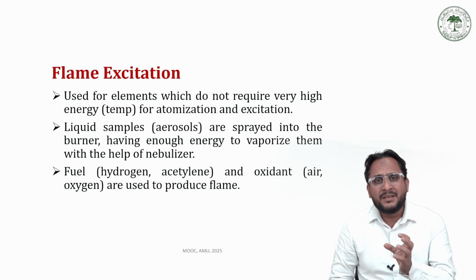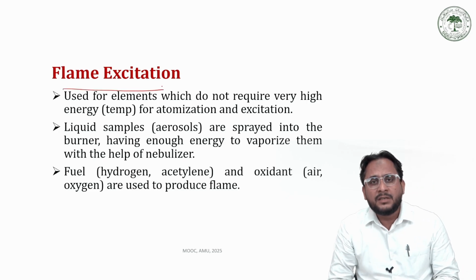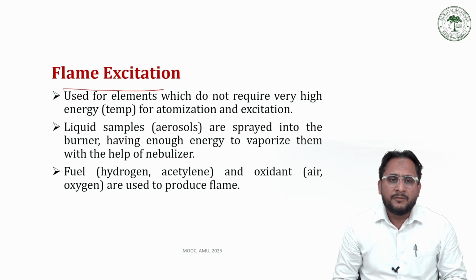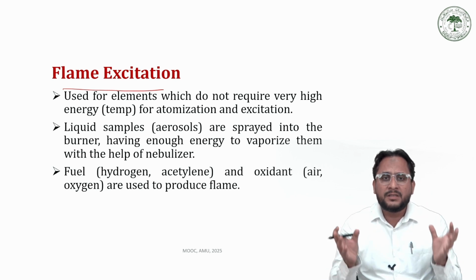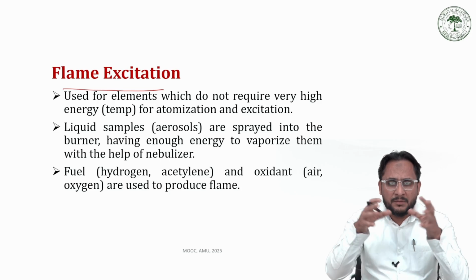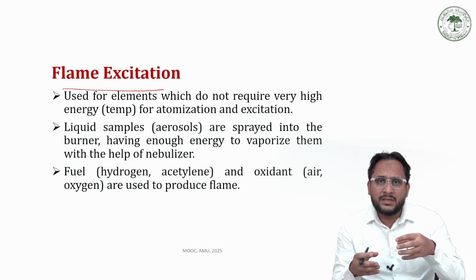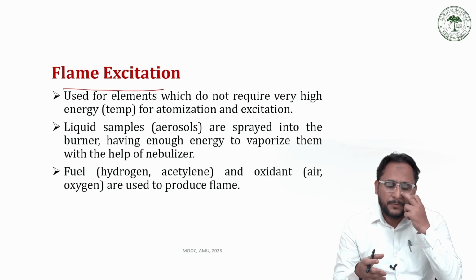But for other metals which are high melting point metals, we do not use this flame excitation technique because of its limited energy. Further, this flame excitation is a type of open excitation, where we heat the sample openly. Openly means we heat the sample in presence of air or oxygen gas as an oxidant or even nitrous oxide.